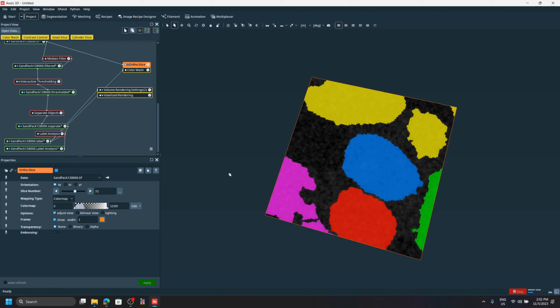And then the other thing is, for example, I have a student who did a scan of a material that he 3D printed, right? And he knows, let's say, the volume of the 3D print material versus air. So you can also have some sort of quantitative check, right? So you can measure the segmentation result and compare it with your experimental data, okay? And it depends on the situation. But the first and easiest is just visual inspection, okay?